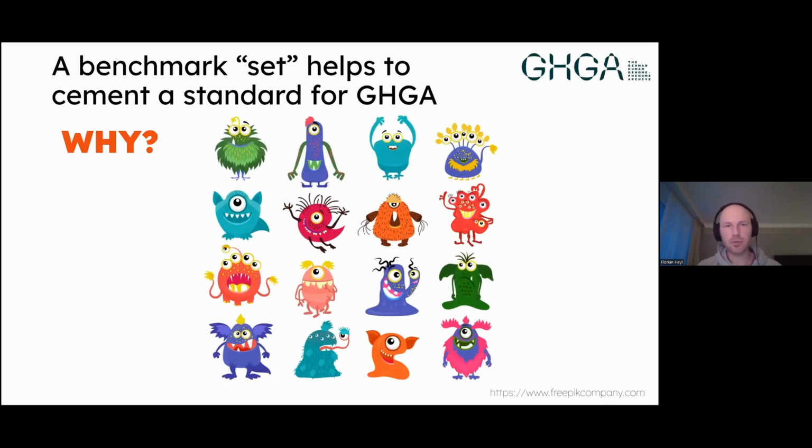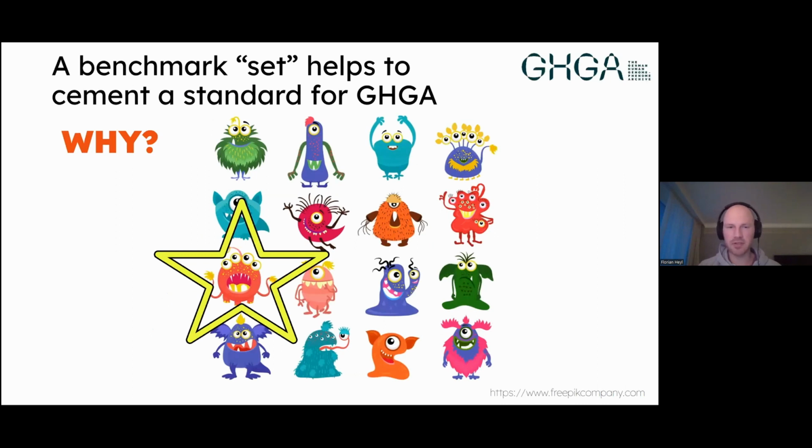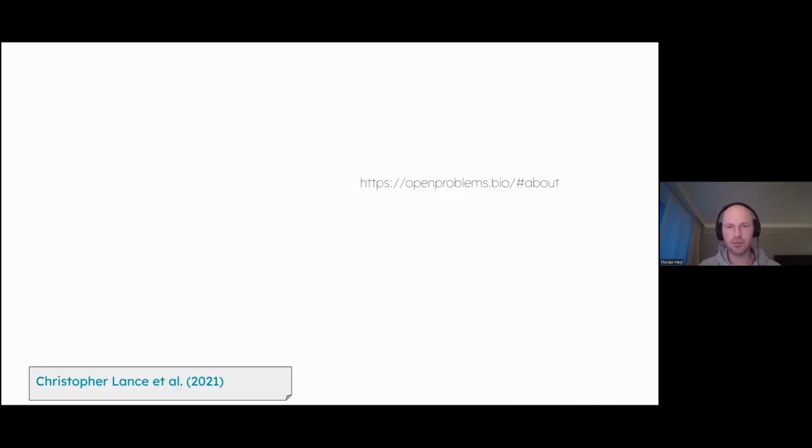And now the last part I want to talk about is a bit how can we make sure, and this goes now into the question, what open challenges do we still have in single cell? How do we make sure that the tools, like a pipeline or a general tool for a specific task, which currently is the best, stays also the best? Or we decide later on to move to a different tool.